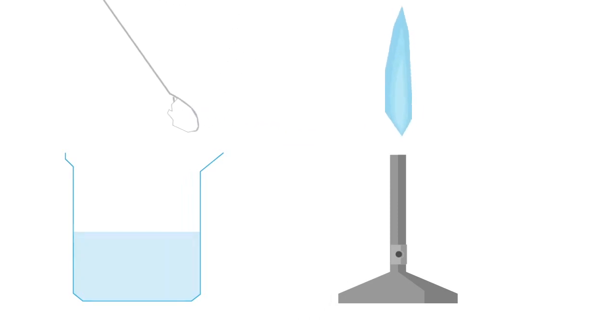Ensure that the nichrome wire is adequately cleaned between each test, or contamination will occur and the flame color produced may not be strong.